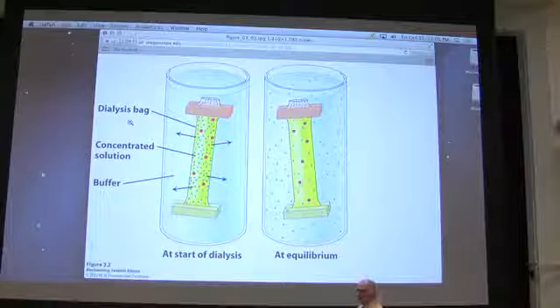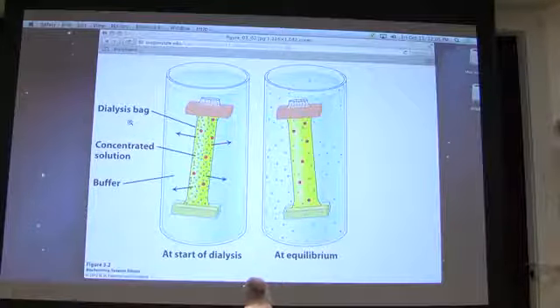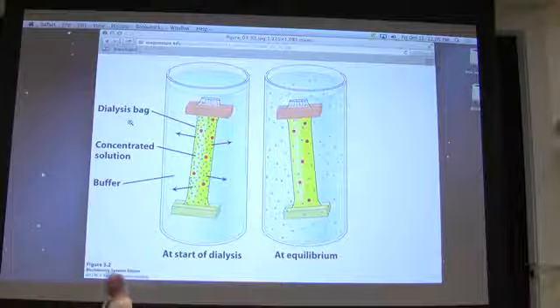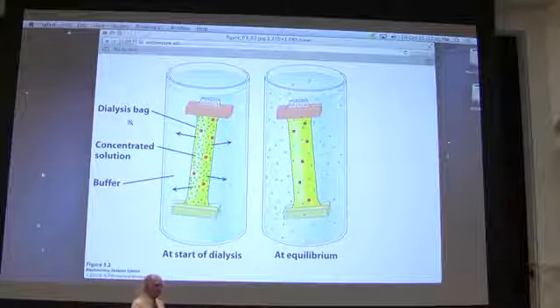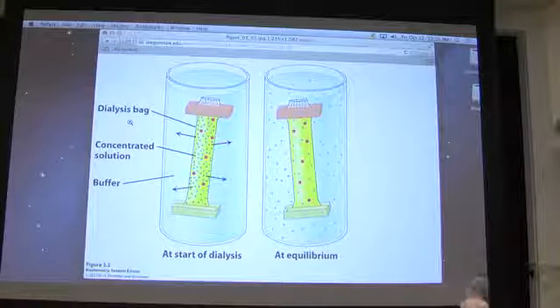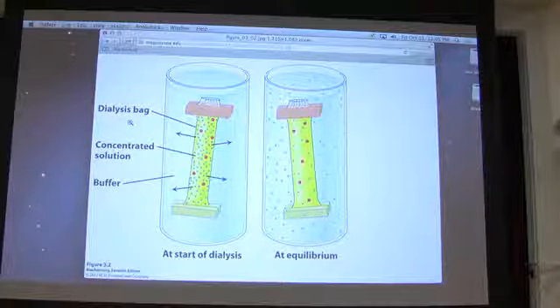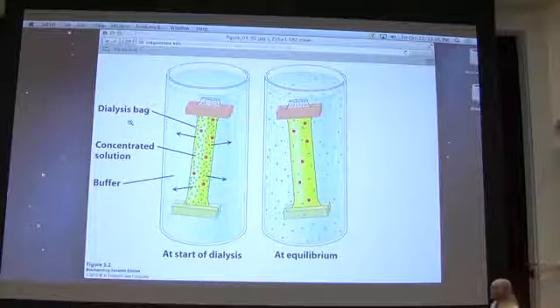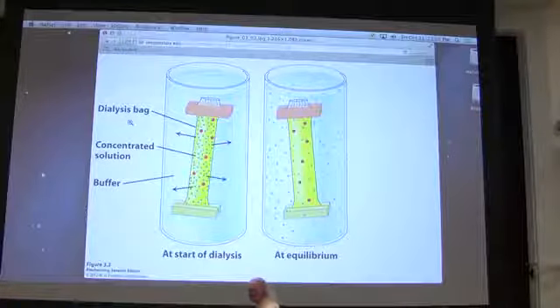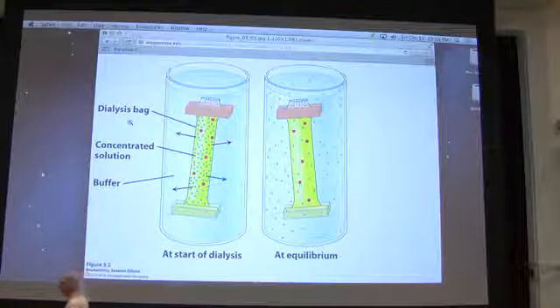Your soup is the thing that you've taken out of the centrifuge that contains the material that you're interested in, and putting it into what's called a dialysis bag. So we've done that here. The yellow that you see on the screen is the soup that we have. Okay? And the dialysis bag has a very useful property that it is porous to the small molecules that are contained in the soup, but it's not permeable to the larger ones.